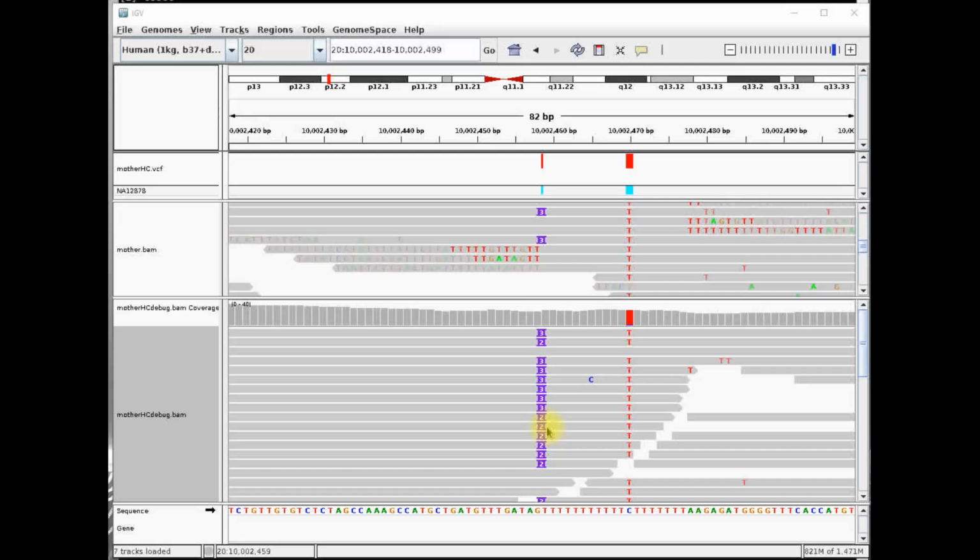This makes haplotype caller more accurate in regions that are traditionally difficult to call. For example, regions with soft clips, like this case, or regions containing different types of variants close together. In those complicated regions, position-based callers like the unified genotyper simply cannot compete.